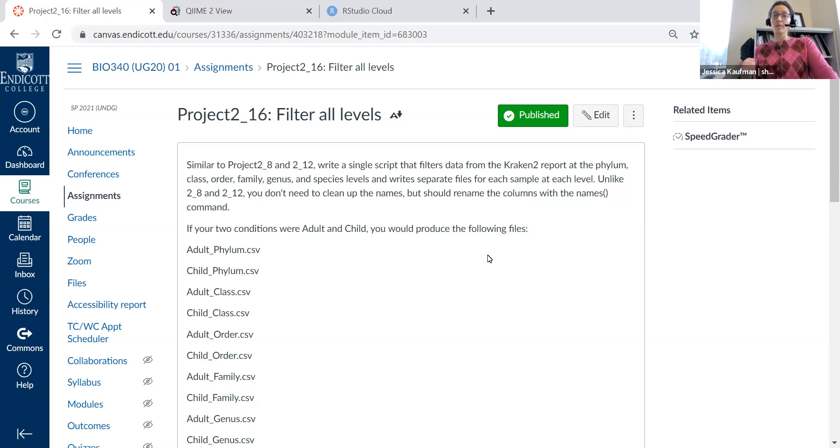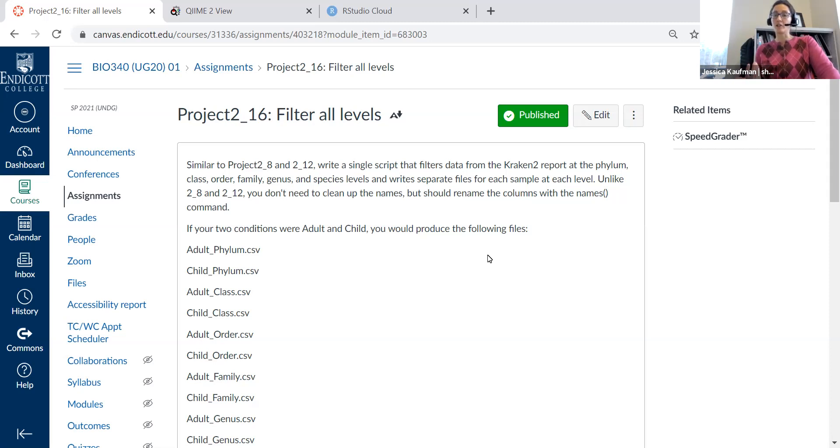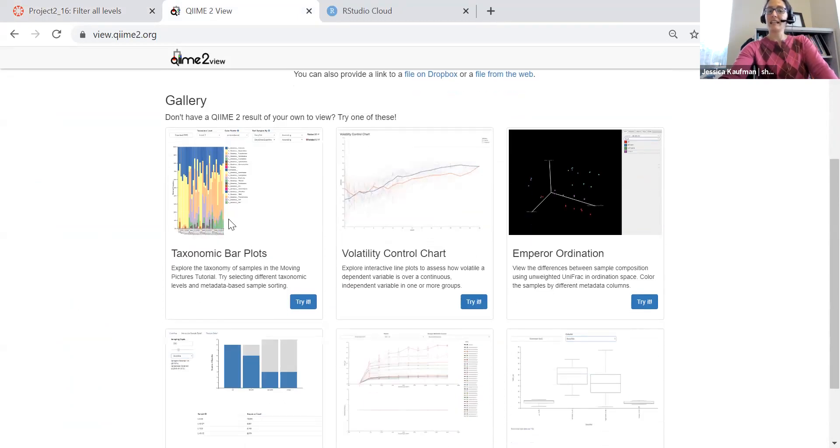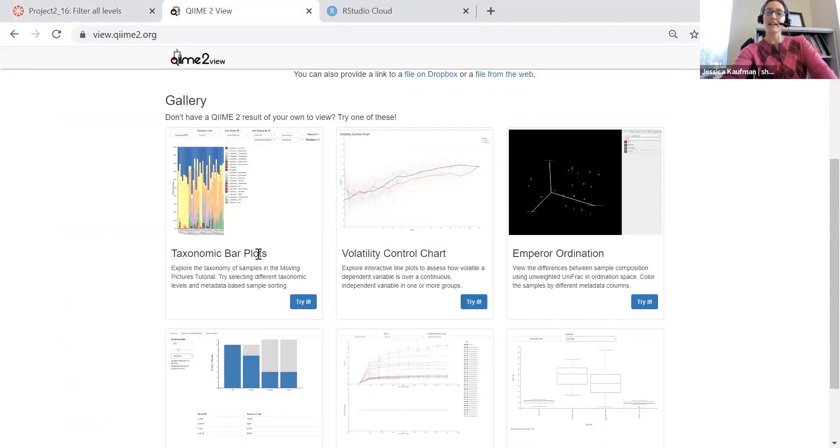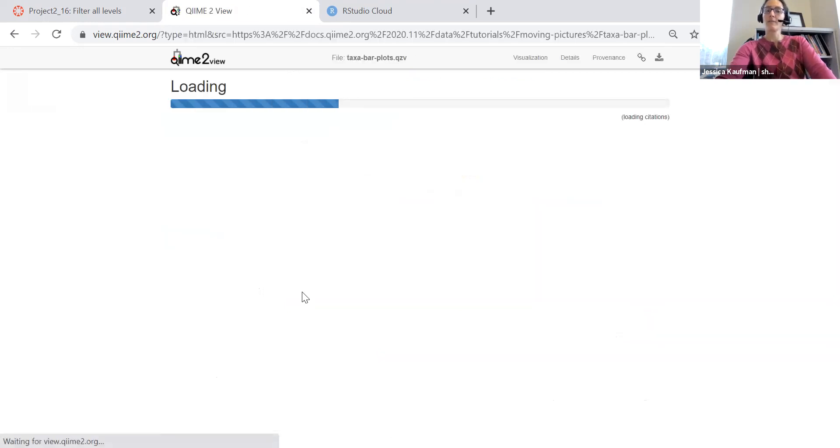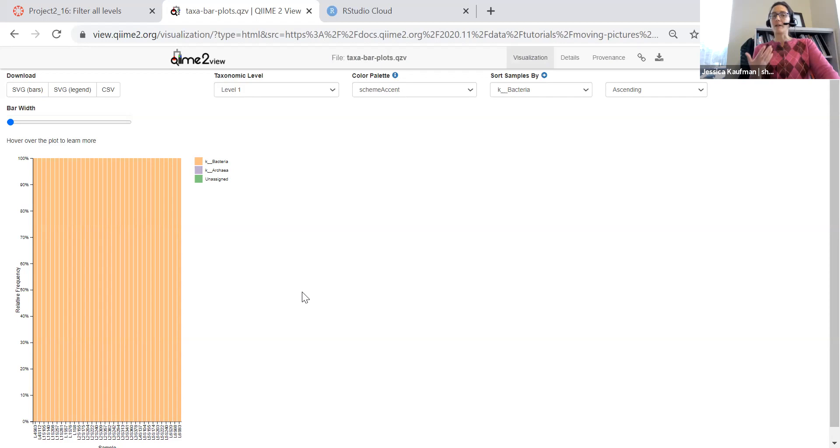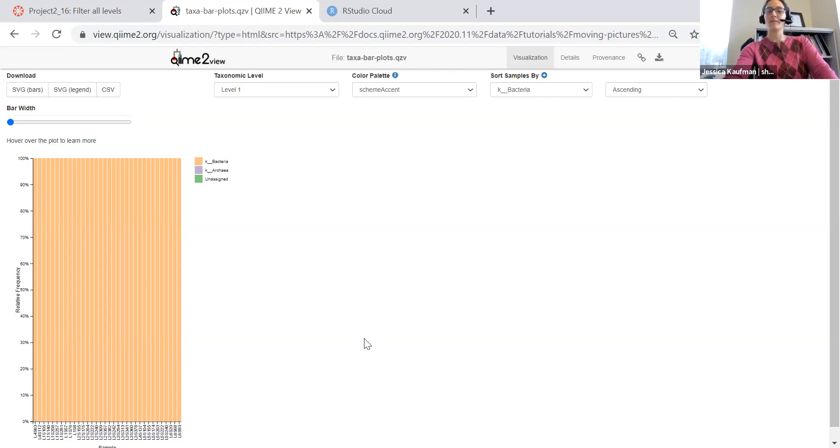If you were doing microbiome research, this is something that you would do with a tool called QIIME. So I'm going to show you a window of the QIIME 2 viewer. You can see they have a preview of data from real taxonomic bar plots. We can play around with this loading tool that lets you in real time on a website switch between taxonomic levels.